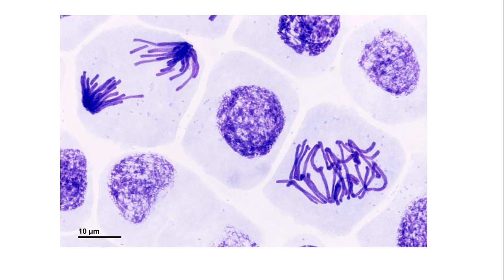A successful image of the cells undergoing mitosis could look a little bit like this. Now, if you have a good understanding of mitosis, you might be able to identify the stages here. So as you can see, in this cell here, the chromosomes aren't visible as thread-like structures. And if you are familiar with mitosis, you would then be able to conclude that this is probably interphase.